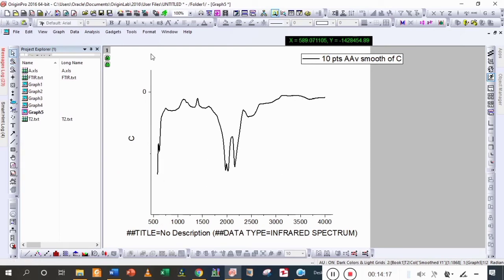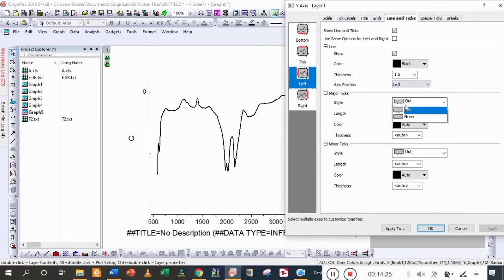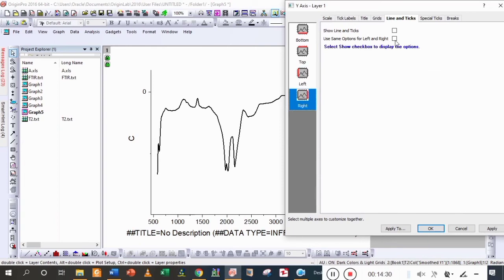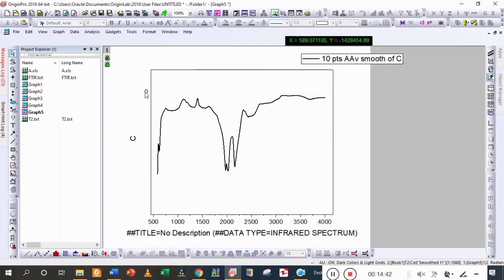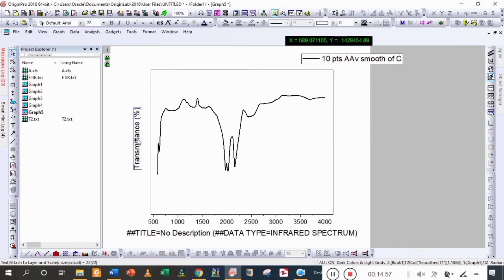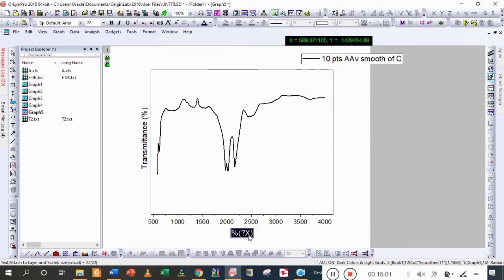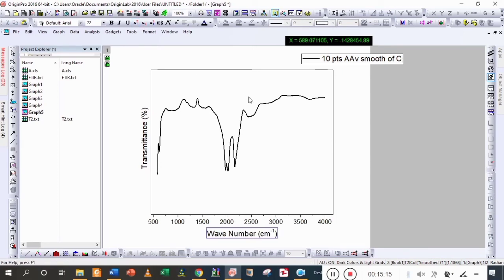There is a little bit of change in the peaks, so firstly I'm going to rescale it. I'm going to delete the intensity label and write its unit — y-axis as transmittance with percentage. Now I'm going to change the x-axis value: wavenumber, and its unit is per centimeter. This data is starting from 500 to 4000.